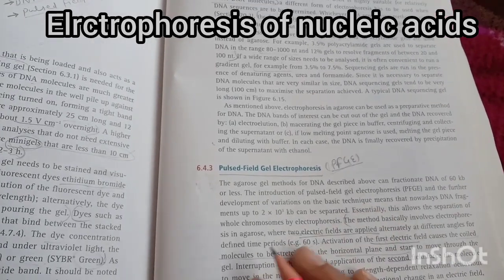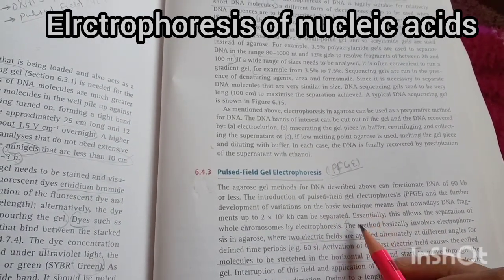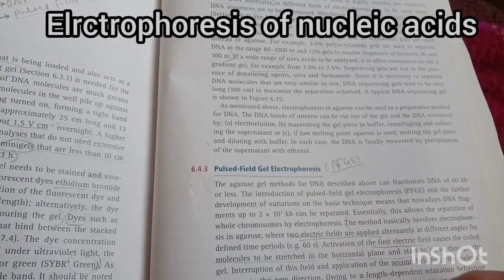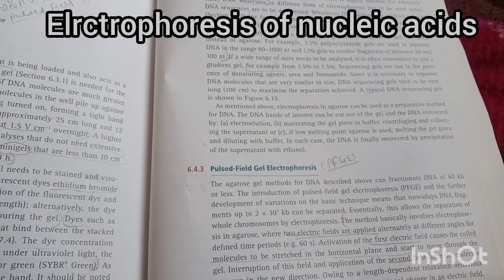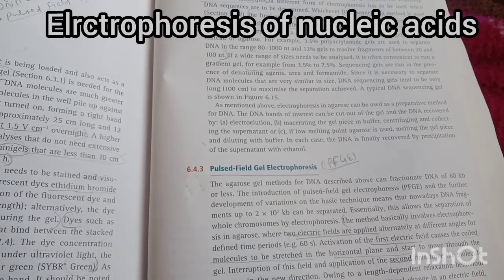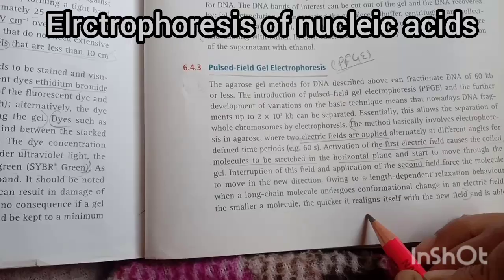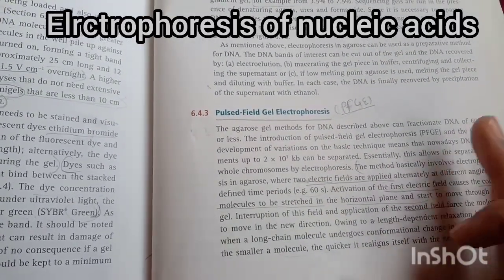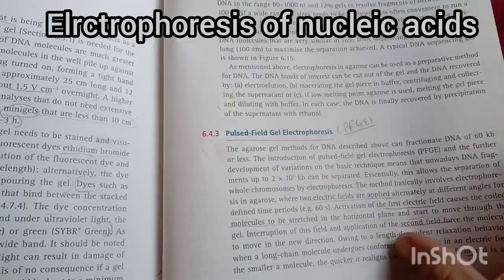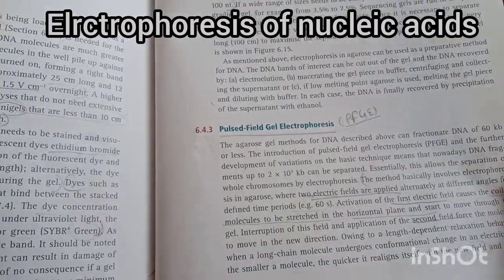So by the two electric fields, we can identify the DNA molecules on the basis of how their distance varies. The smaller molecules align themselves with the new field more quickly. We all know that small molecules move faster in comparison to large molecules. So we can identify molecules on the basis of size by using pulse field gel electrophoresis.